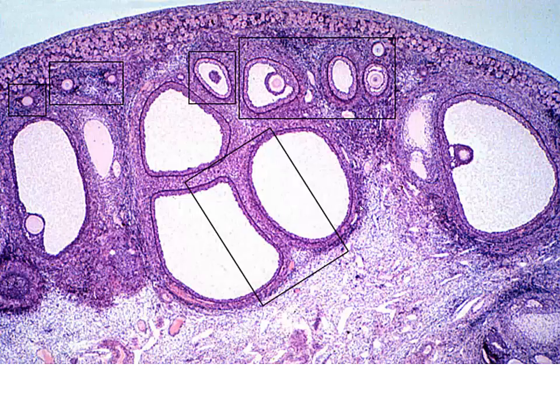Now, pulling away just a little bit, we can see once again where we have our primordial follicles in this outer cortical region. Then we have a number of different stages of follicular development as we move along. This will be our Graafian follicle. You can see it's almost completely detached. Most people will go ahead and call this Graafian, but really for technical reasons, if there's still an attachment, then we still call it a secondary follicle.